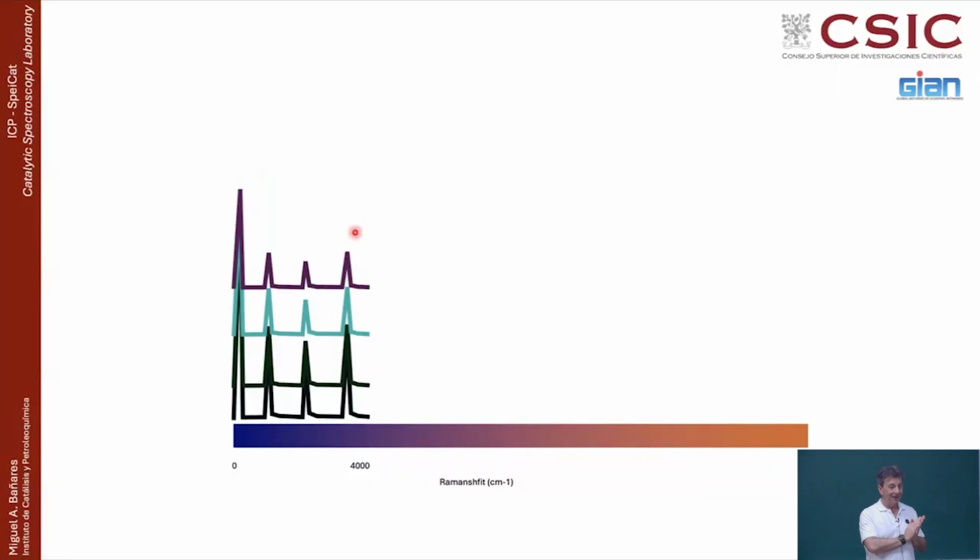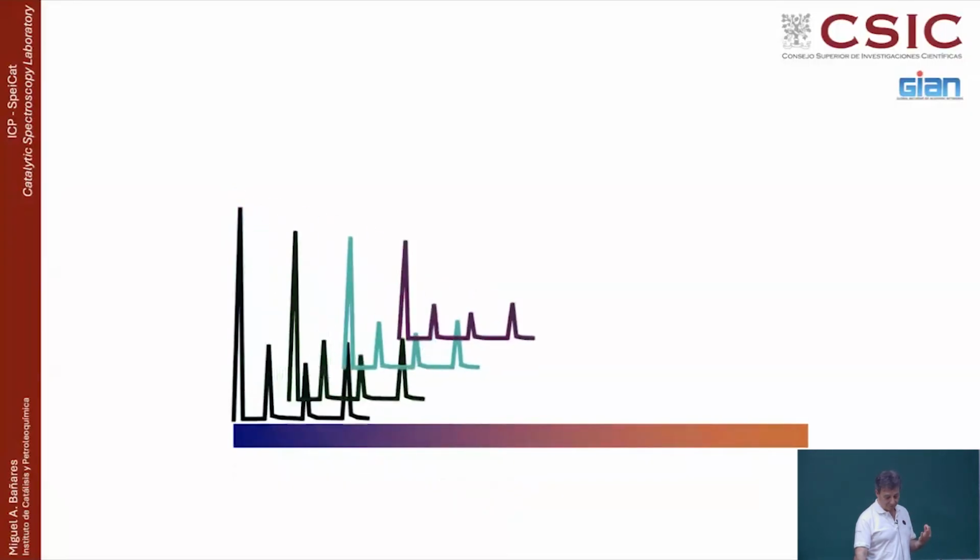Okay, that is important because we are dealing with a difference. So no matter that we are working with high energy photons, with energy much higher than the vibrational frequency, in the end what we are looking at is the energy taken by the sample. And this is what the Raman spectrum represents, the energy taken by the sample presented in centimeters to the -1. And that's why we don't call it frequency, but Raman shift, because it is not an absolute frequency, it's a different frequency.